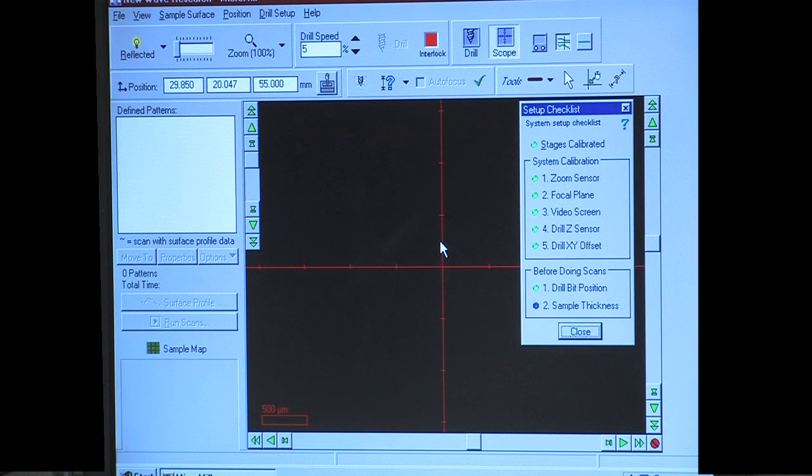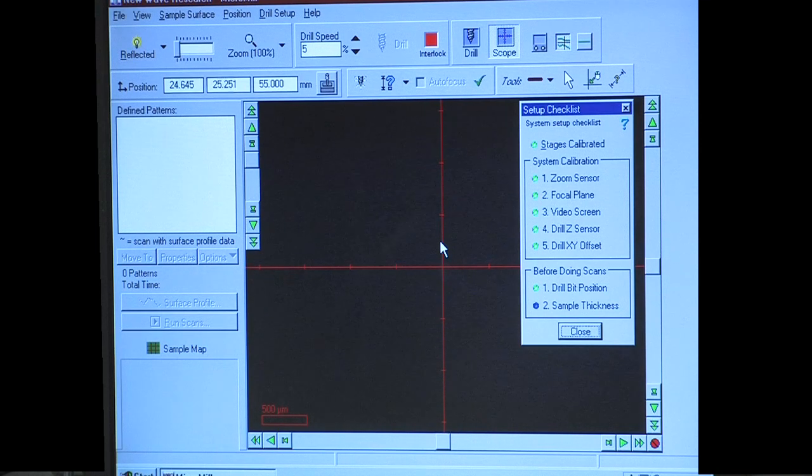Once this setup is done, you should have a series of green lights light up in the Setup Checklist window, except for the sample thickness.